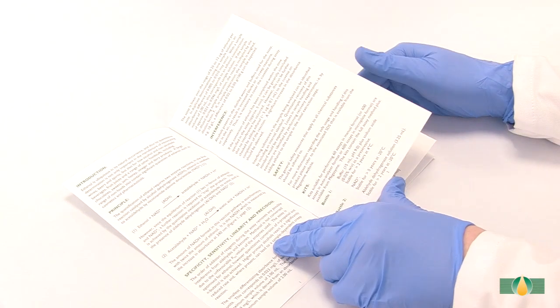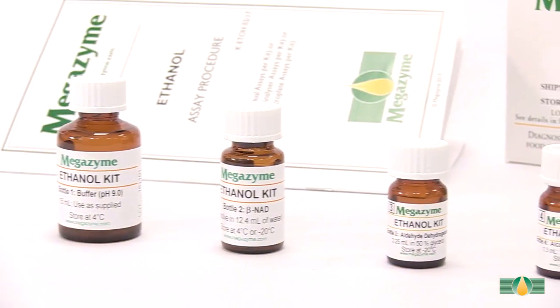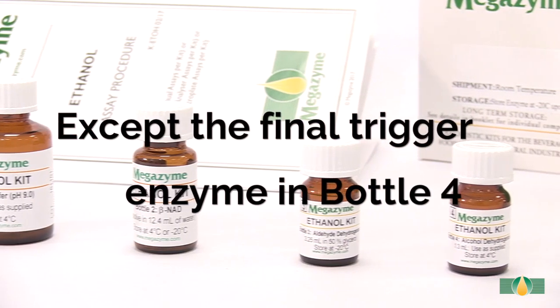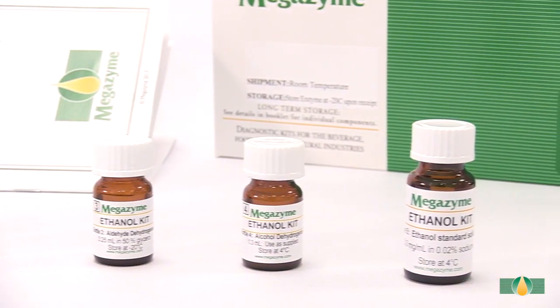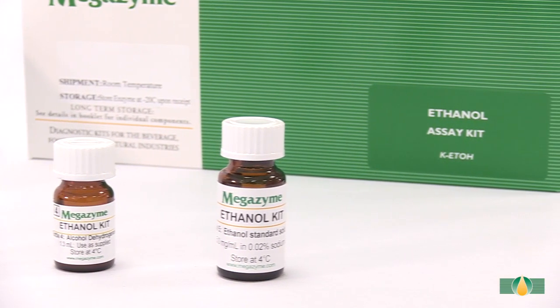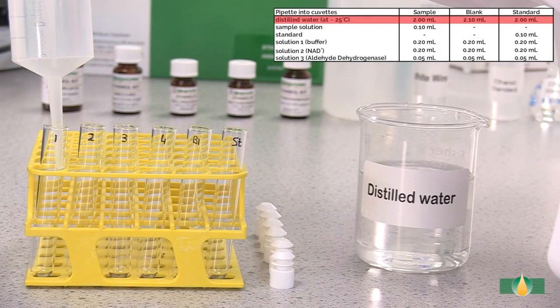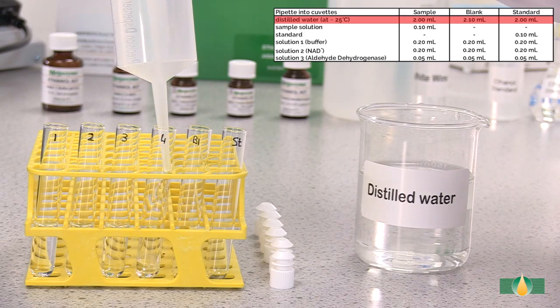Follow the manual assay procedure as described in the data booklet. Pipette all assay components except the final trigger enzyme in bottle four into each assay tube. A blank reaction and a standard reaction must be performed with each batch of samples. Pipette 2.0 milliliters of distilled water into all assay tubes.